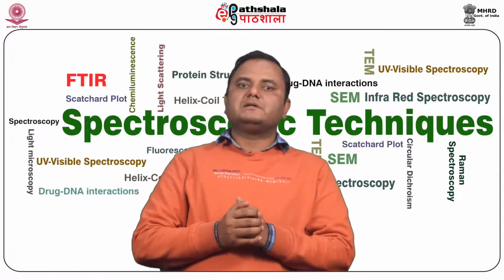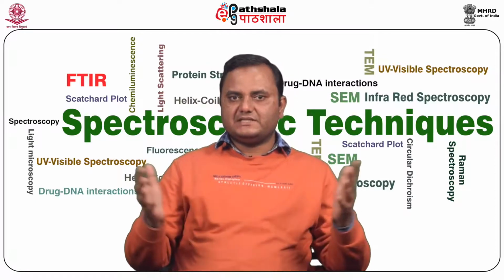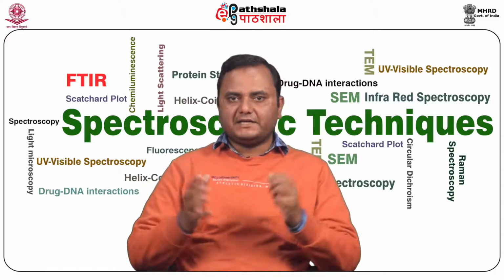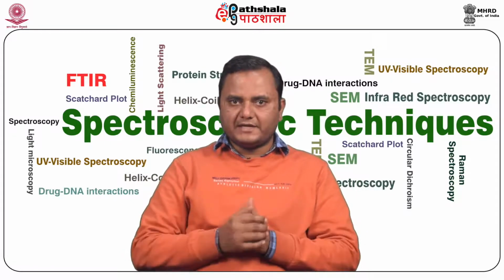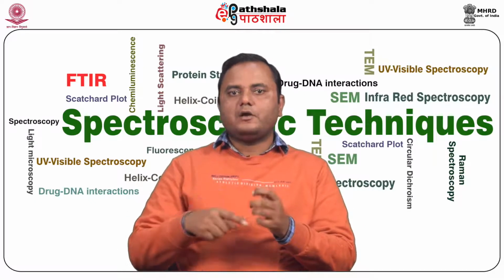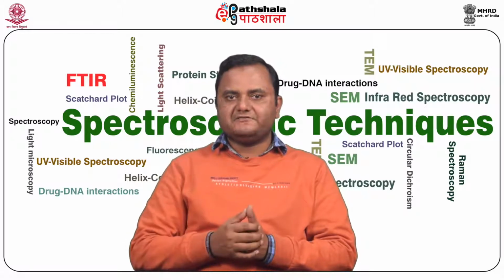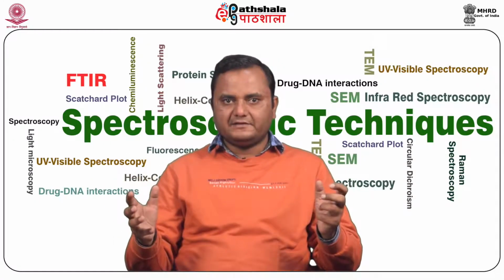Now we discuss the basic concept of circular dichroism. It is simply the measurement of how an optically active compound absorbs right and left-handed circularly polarized light, and all optically active compounds exhibit CD in a region with an appropriate absorption band.